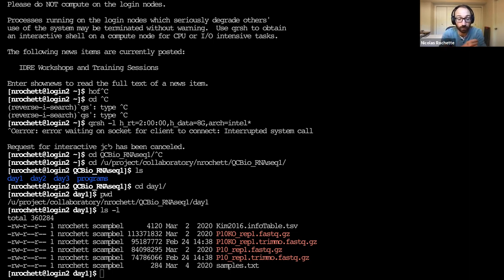So you start with the first read, the first read out of your 10 million reads, and you try to put it at the first base in the genome sequence, then the second base, and then the third base of the genome sequence. If you do that for every base in the genome and for each of your 10 million reads, it's just not going to work.